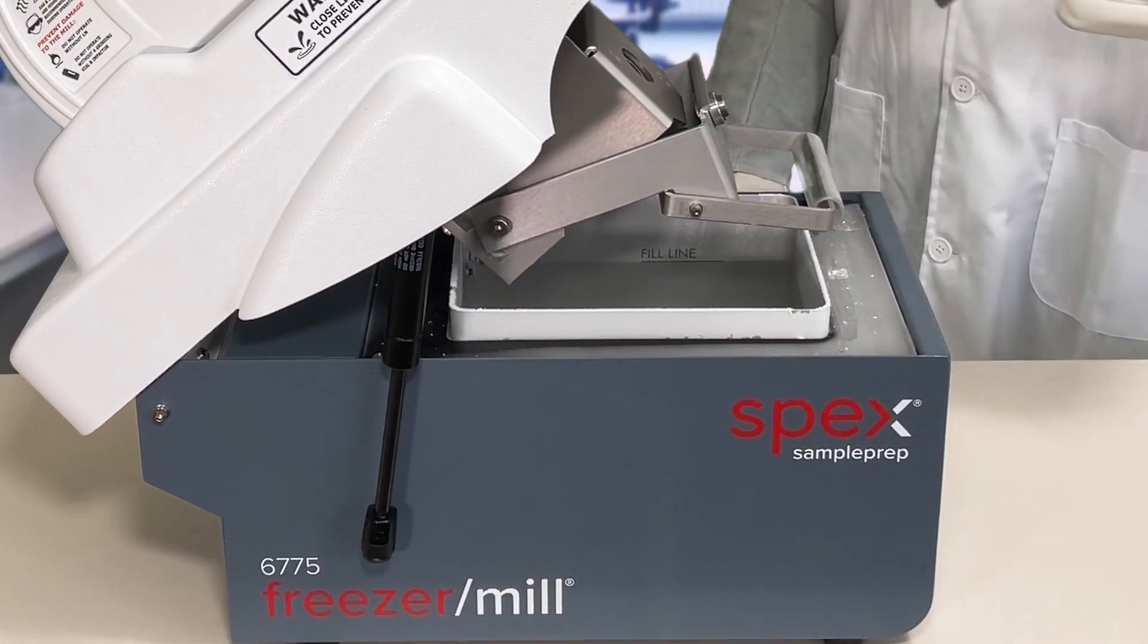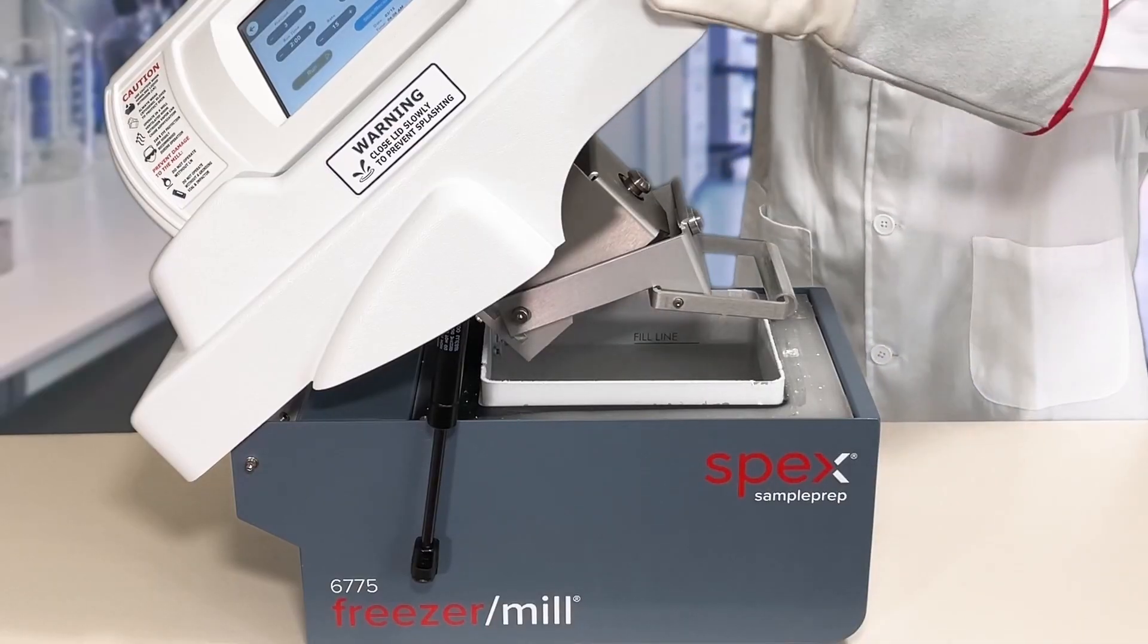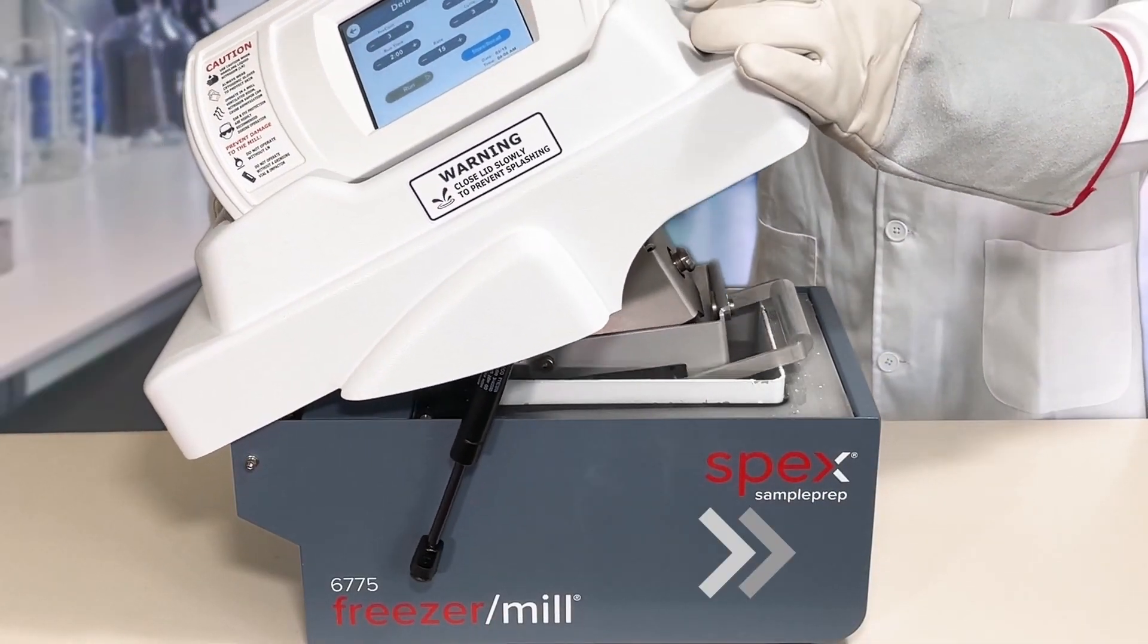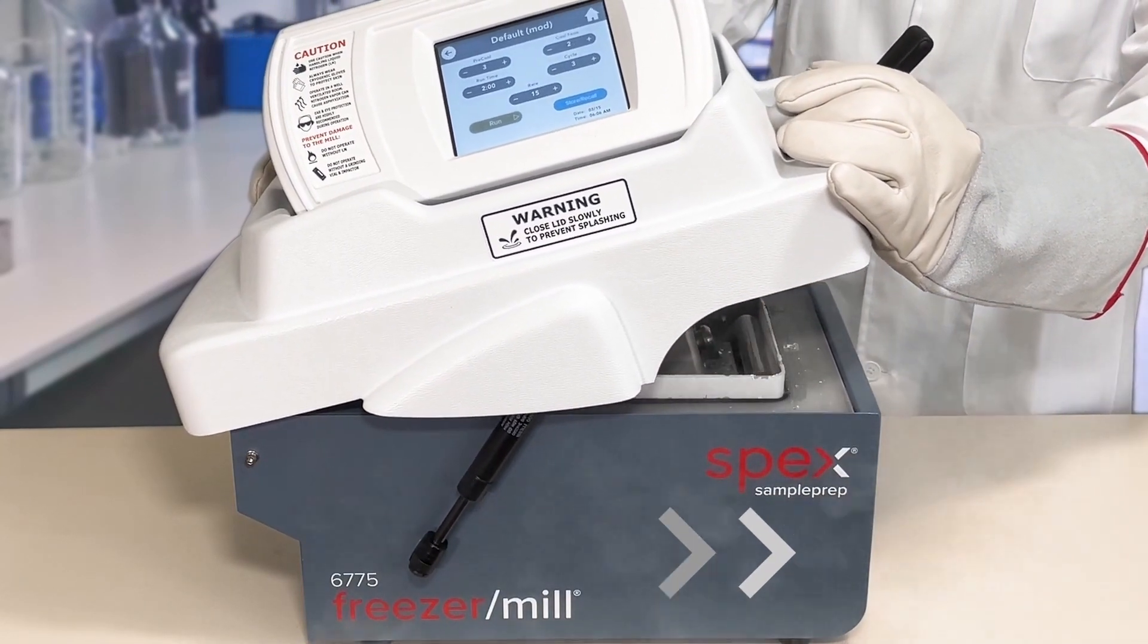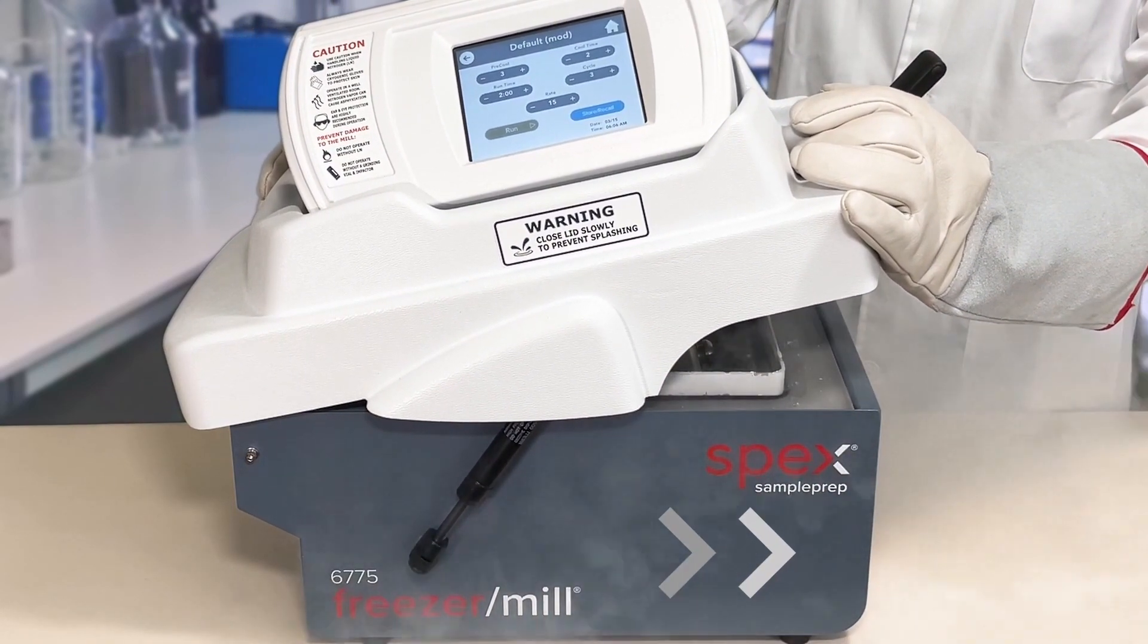Add the vial to the milling chamber and close the lid of the Spex mill slowly. Fast closing of the lid will cause spills of liquid nitrogen on the work surface and potentially on the operator.